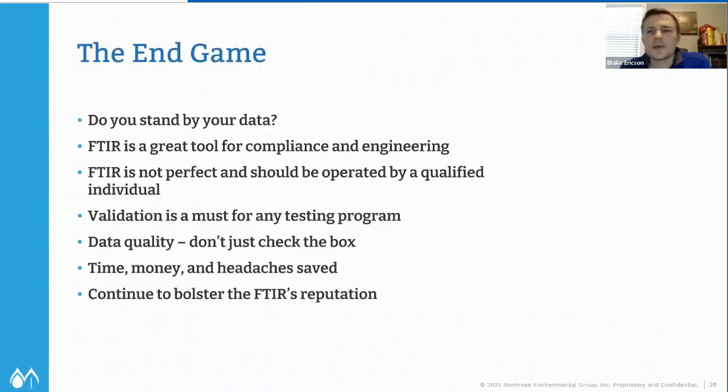So we made it to the end of the presentation. It should be noted that the Max GC FTIR can be used for a wide range of applications too, but more or less, we like the real-time stuff a lot. So that Max IR, the MKS, there's other companies like Spectrum, you name it. They do some nice stuff with FTIR.